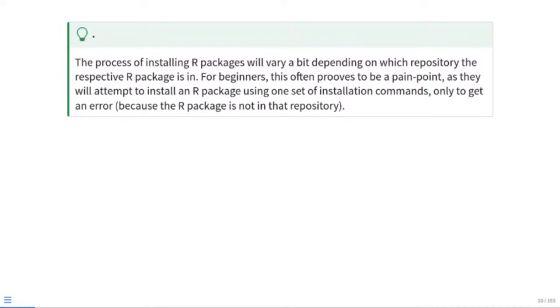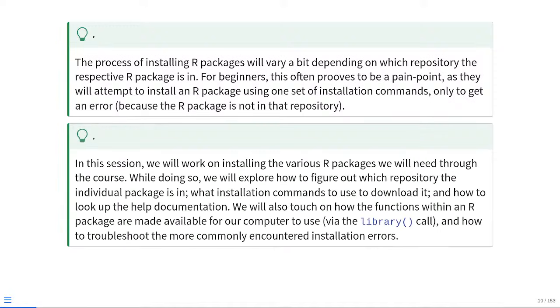So the main focus of today is walking you through this, pulling back the curtain to understand a little bit more of how you go about doing this, how you go about troubleshooting this process. And we'll also be touching on the concept where I was having issues back in 2020, because I had not attached the installed package to my local environment, which is done via the library call. So between both of these points, we'll be talking about most of today.